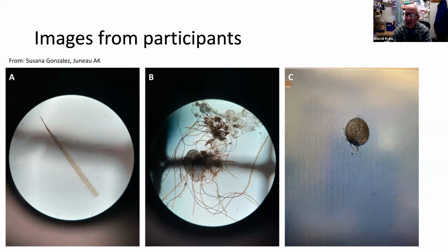That's it. So what Evie and I were also discussing is that you need to look at your whole sample in its entirety, scan it and see what the dominant players are. Then as you're going along trying to make identifications, you can say, oh yeah, it has the characteristics of this dinophysis cell, but it's on a weird angle.